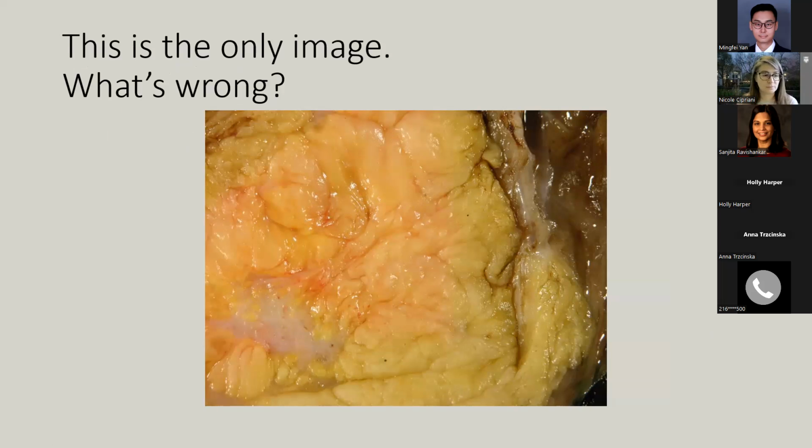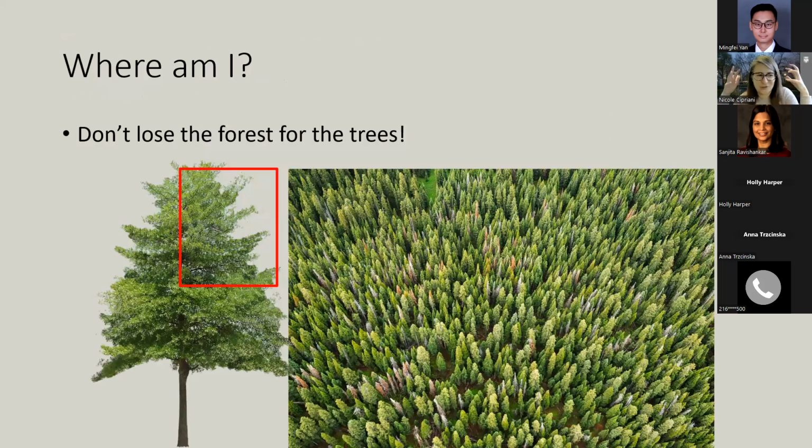Okay, this is the only image. What's wrong? Like what's going on, right? You're so zoomed in. You're like, where are we? What specimen is it? What does the border look like? I don't know. So I try to tell people, don't lose the forest for the trees.